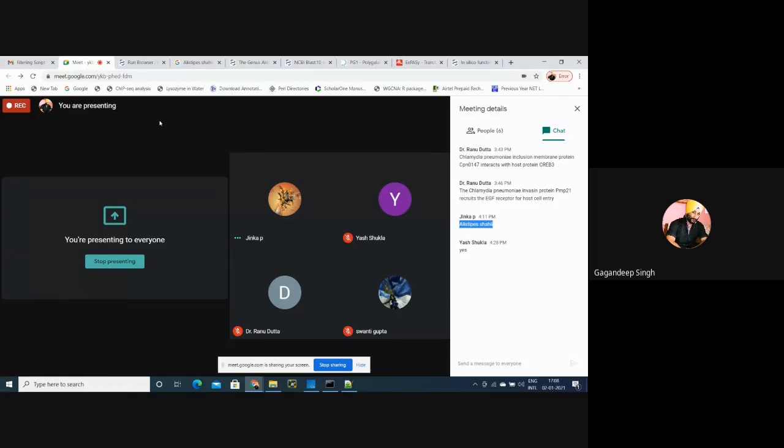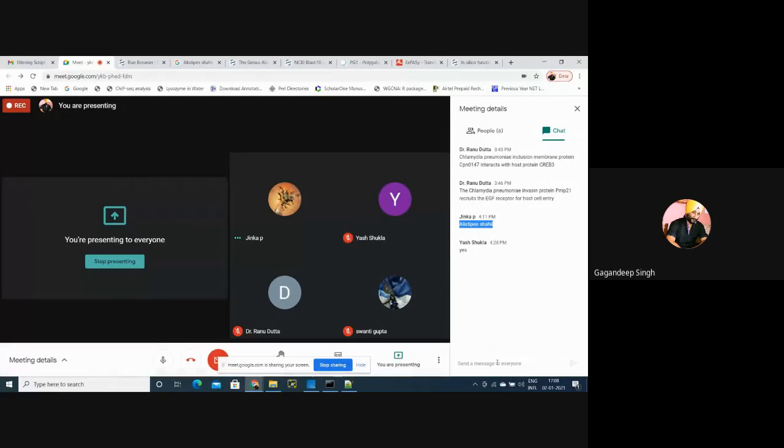Okay, for read mapping I need a Linux system where we'll do some mapping work. How to do it, I'll try to manage that work by using a Linux system. For read mapping, we need a tool known as Bowtie. I'll text the name, Bowtie 2.